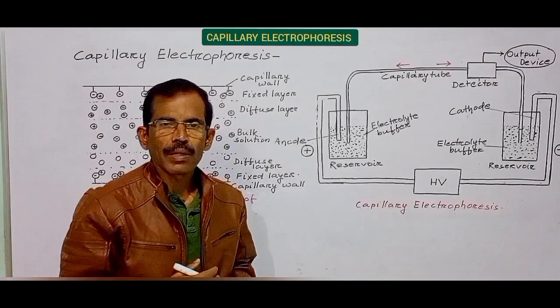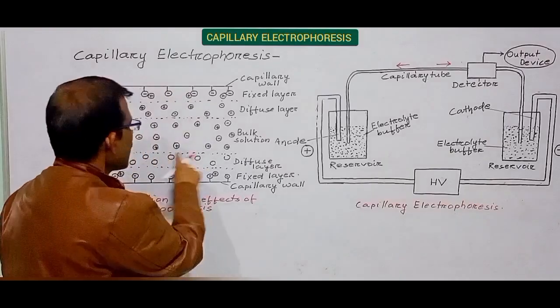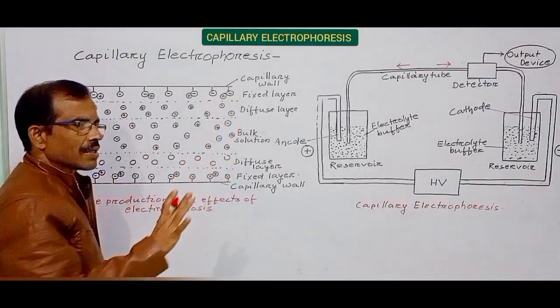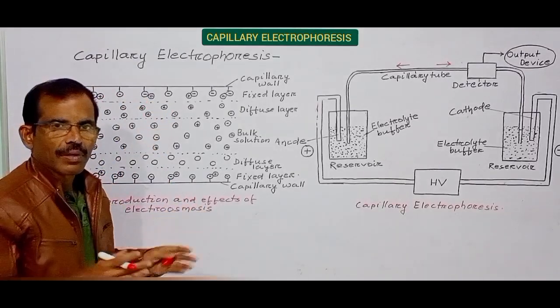One of the fundamental processes that drive capillary electrophoresis is electroosmosis. Silica capillaries contain silanol groups that become ionized in buffer.